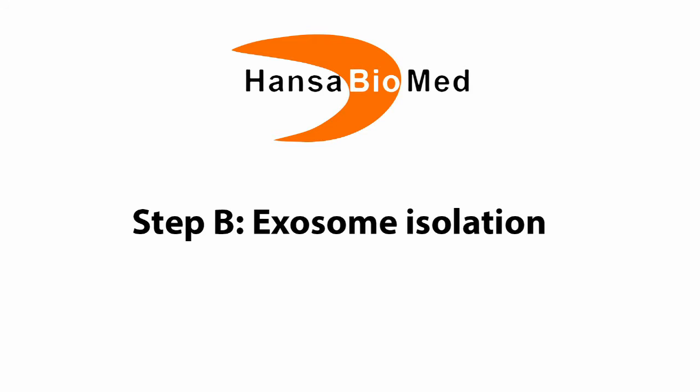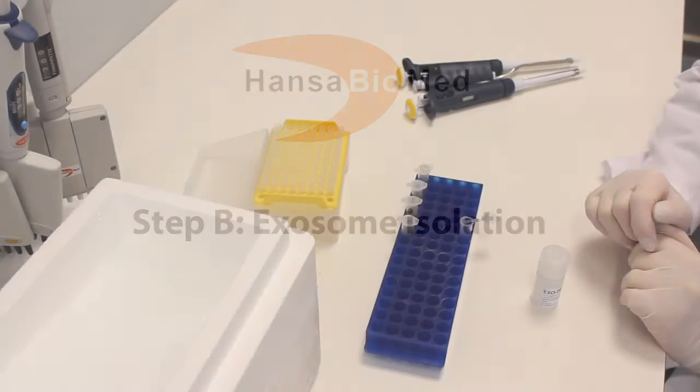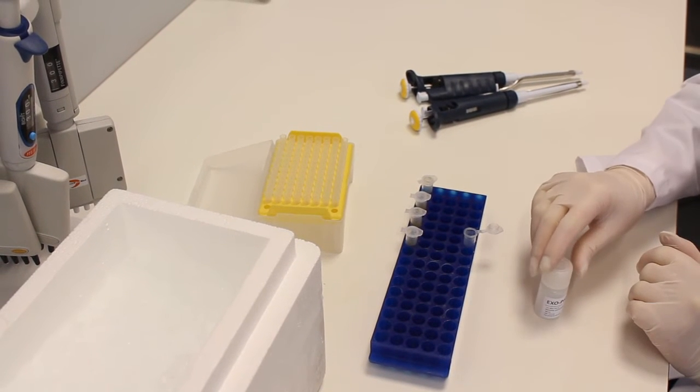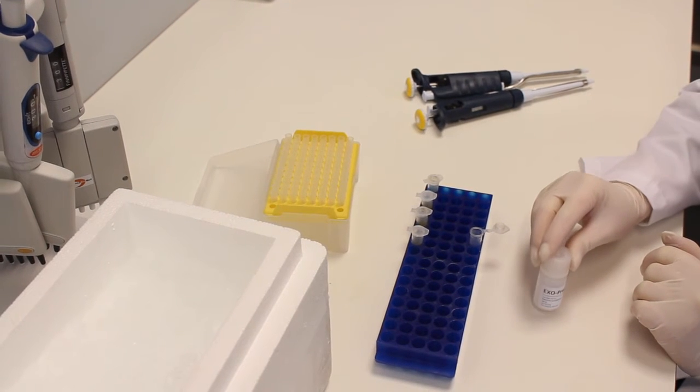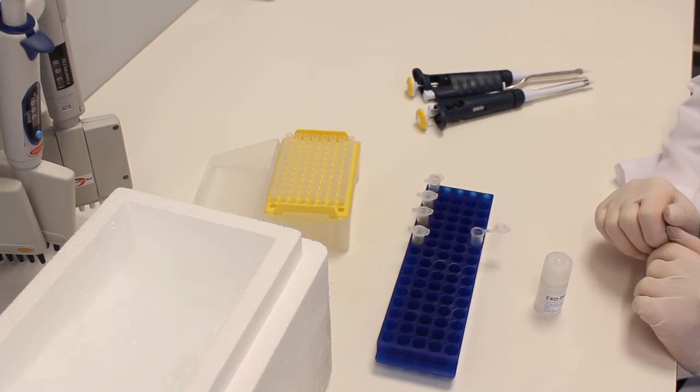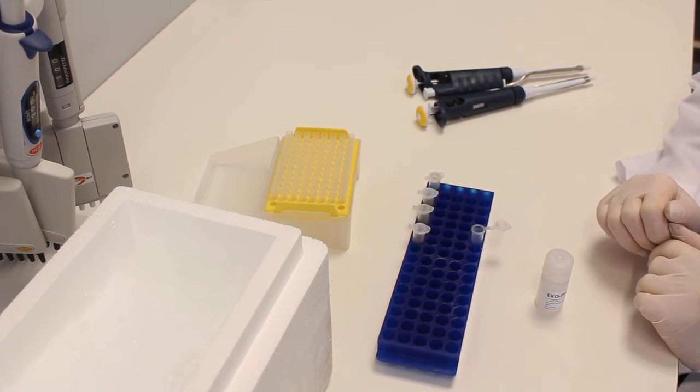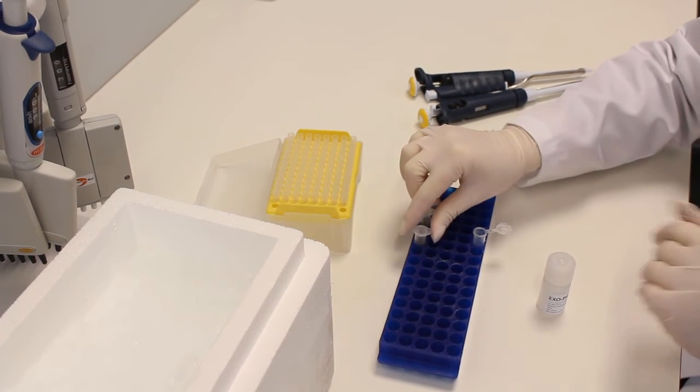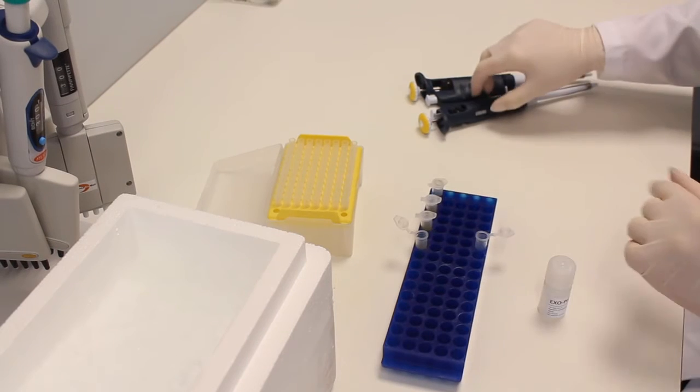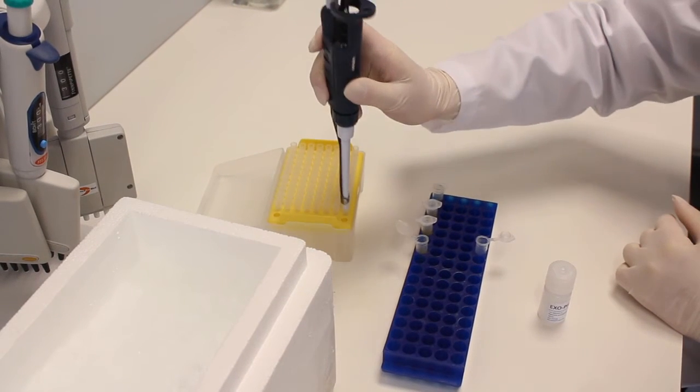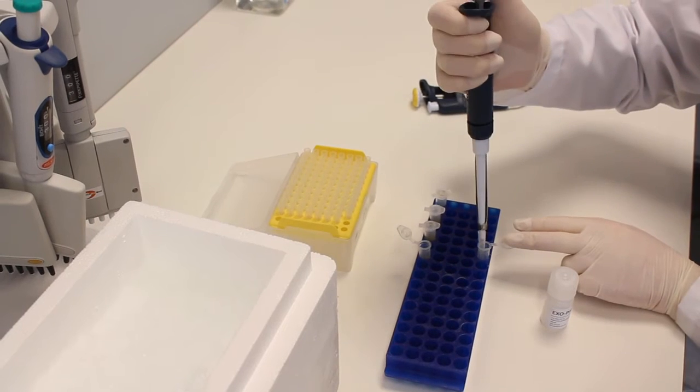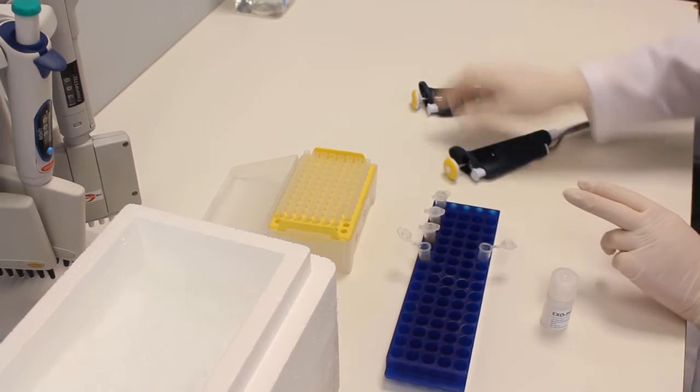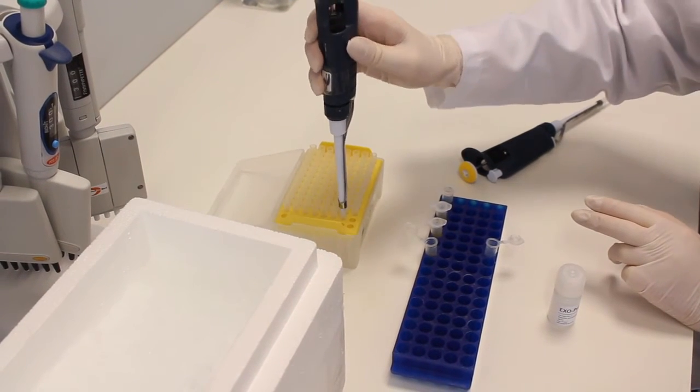Step B: Exosome isolation. Add Exoprep solution to your sample in ratio 1 to 4. It is recommended to use 100 microliters of plasma per one isolation. It means that we take 100 microliters of plasma and add 25 microliters of Exoprep solution.